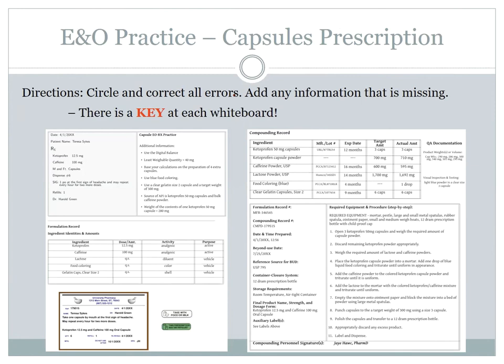So now the last thing is Judy is going to go through and just mention a couple of things for checkout that we're going to do as a group here. That way, when we do check out with you, we will just do your quality assurance for your products, your capsules, and then you'll be free to go.